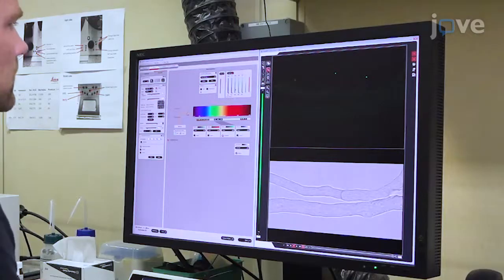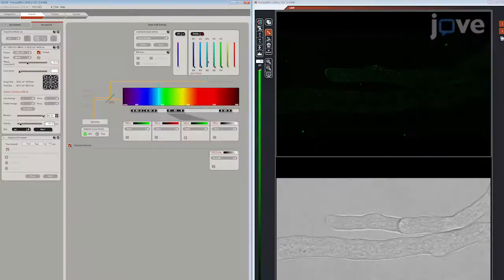With colleagues from the Department of Nuclear Medicine of the Medical University, we recently used these staining techniques to develop a novel approach for image-guided diagnosis of aspergillosis. The ability to monitor membrane and cell wall structures in real time was crucial for determining the uptake dynamics of the experimental drug compound.